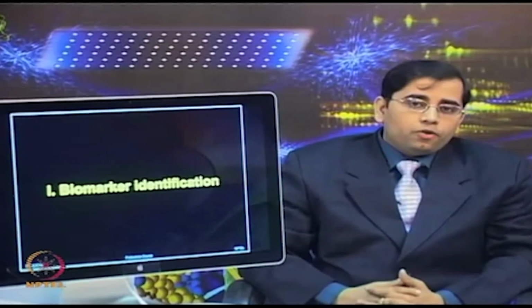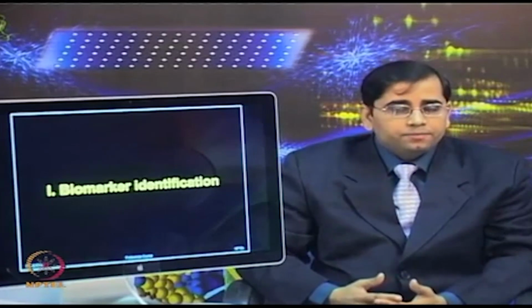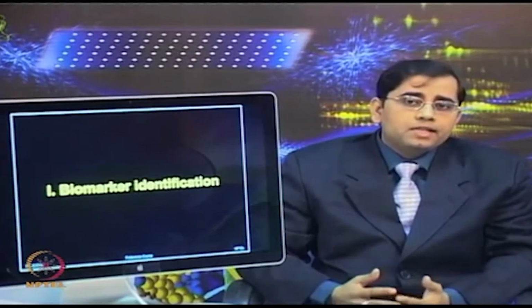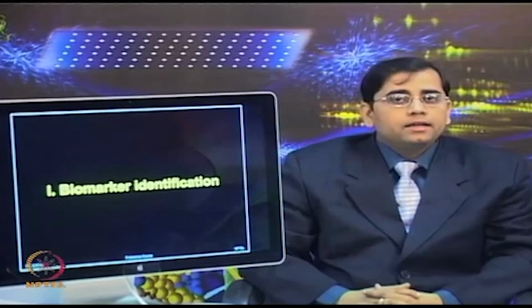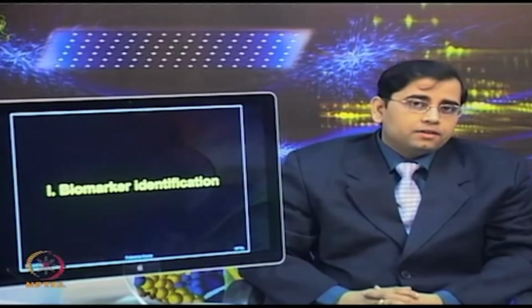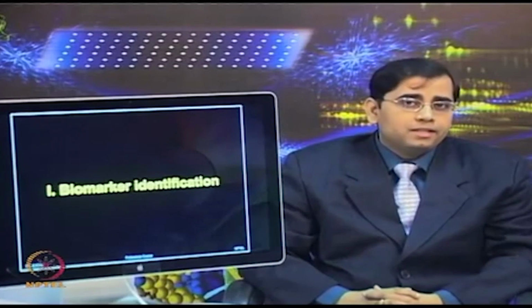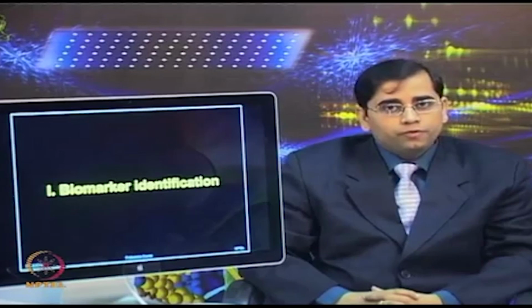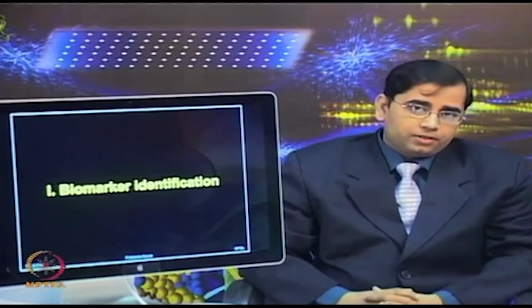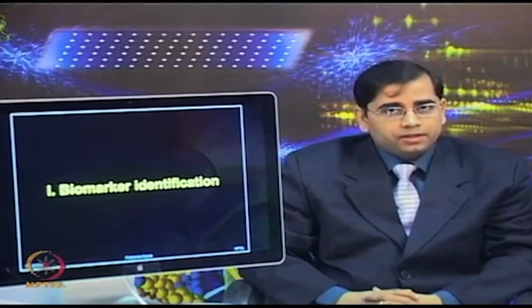As you know, there is a need for early detection and therapy of diseases such as cancer. However, the discovery of specific and sensitive molecular markers remains challenging. So, people employ different types of technologies, including protein microarray based systems, to identify biomarkers which can be used for early disease detection as well as accurate diagnosis and different other applications.